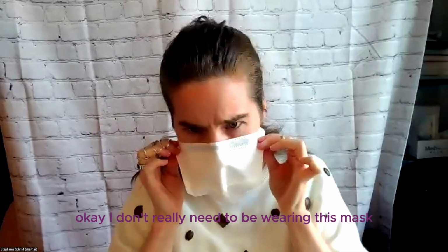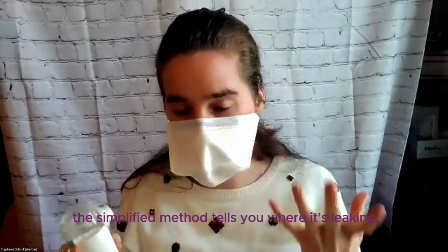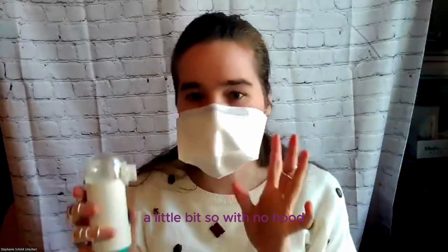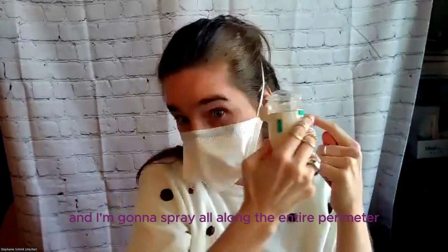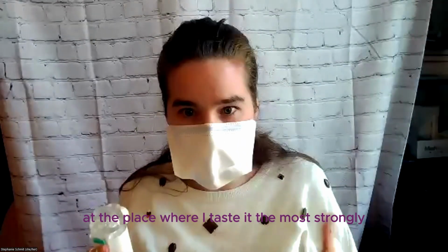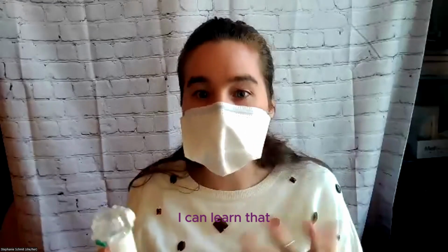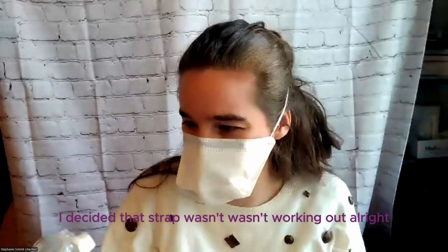Okay, I don't really need to be wearing this mask. Oh no, I'm showing you the simplified method. The simplified method tells you where it's leaking a little bit. So with no hood, I'm going to spray all along the entire perimeter. And then at the place where I taste it the most strongly, I can learn that that's the place where it's leaking the most. And maybe I can adjust it in some way that makes it fit better. I decided that strap wasn't working out. All right.